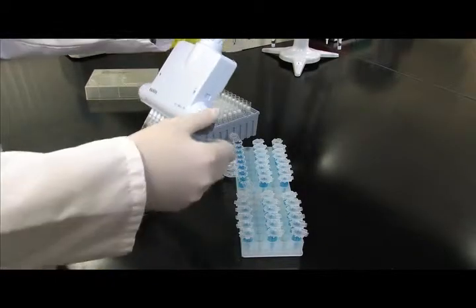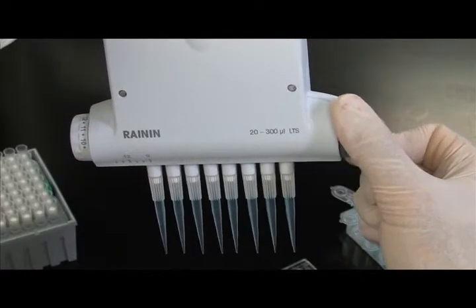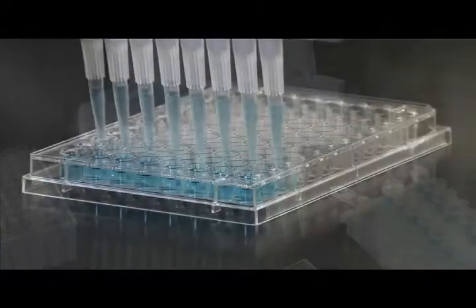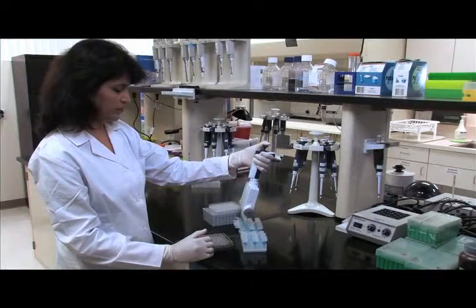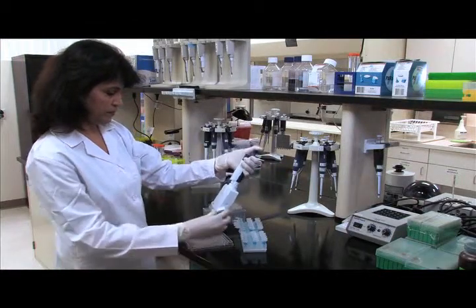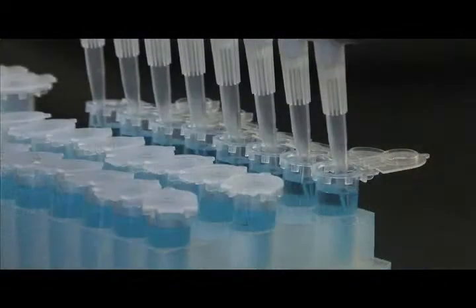Increase your productivity with Raynin's Pipette Lite Adjustable Spacer, the world's only manual multi-channel pipette with adjustable spacing. With this pipette, a simple twist of the dial is all that's required to change the channel spacing.